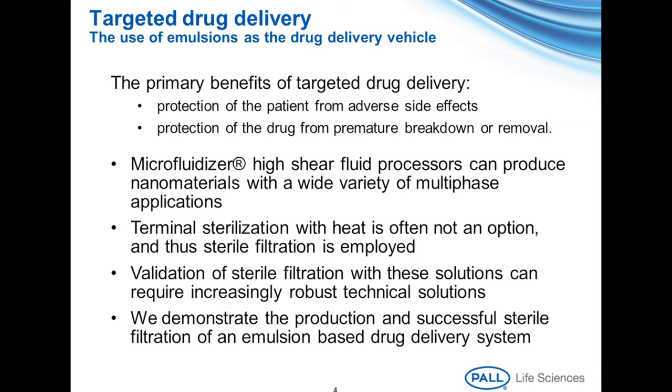Validation of sterile filtration with formulations such as these nanoemulsions can require increasingly robust technical solutions. During this webinar, we will demonstrate the production and successful sterile filtration of our nanoemulsion-based drug delivery system.